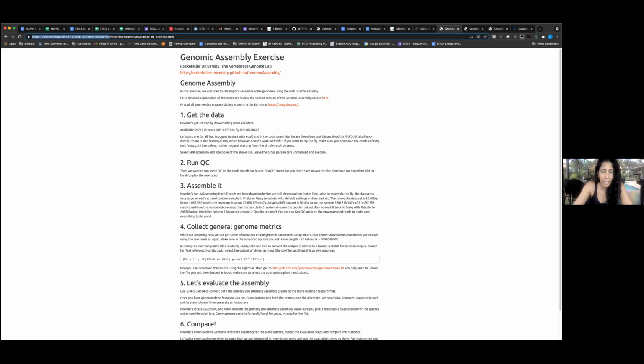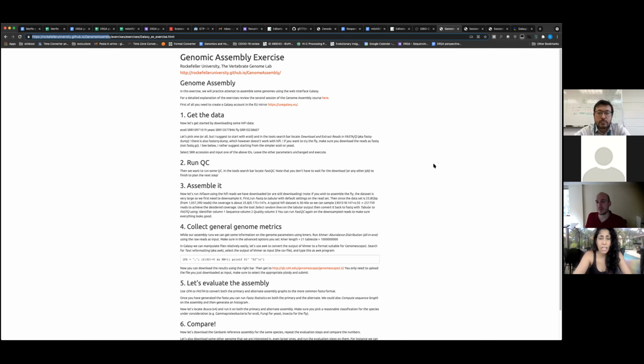I had some challenges downloading some of the other data. I followed the instructions, but I don't know if there was just something going on, or if I was picking the wrong things. It seemed to upload the data, but when I went to do the evaluation steps, it wasn't finding it, or I wasn't sure where to look. Maybe after you share your screen, we can have a look at what's going on.